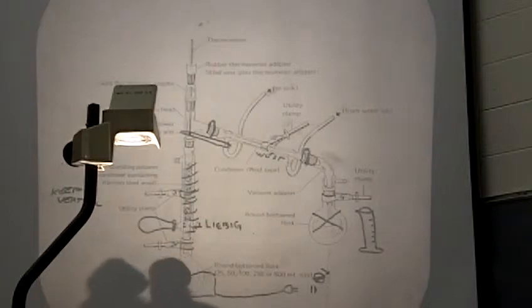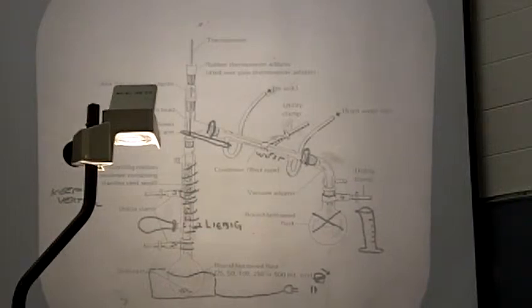But with that, keep peeking into your round bottom flask and make sure you watch what's going on in there, okay? So you don't want to go to absolute dryness with the distillation, right? So you will have a little bit left, and you will want to measure what that volume of that little bit left is. And so that's what that hold-up volume is.